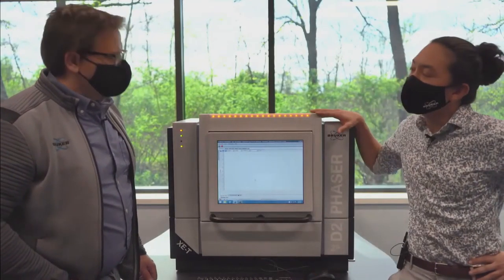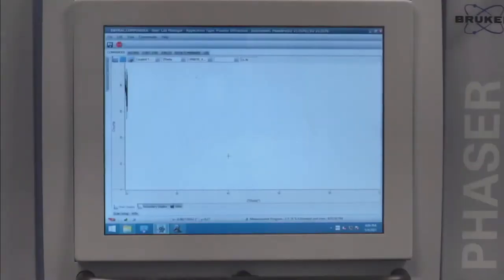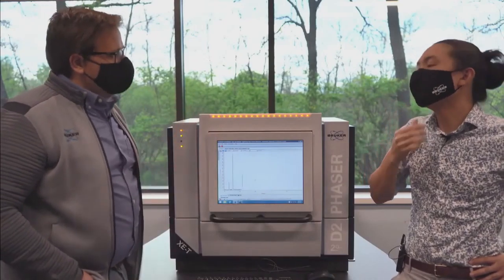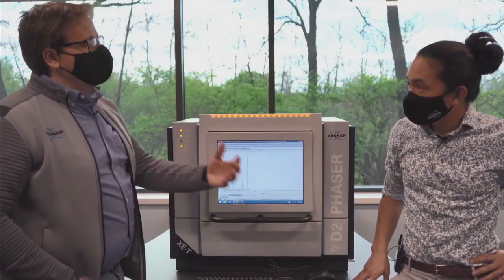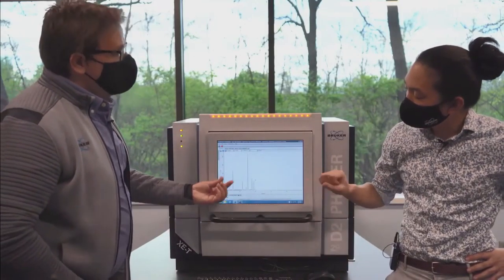I've set this up for about a minute. So very, very fast data collection. And a lot of this is enabled by the fact that we have those 192 strips in there. So effectively, this is 192 times faster than what you would see for scintillation. On older systems, you might have that scintillation detector with the 0.1 millimeter slit. Exactly. And the reason why we get that gain is because it's like having 192 of those stacked up next to each other, right on top of each other. Now, do you take pictures and then you move it?